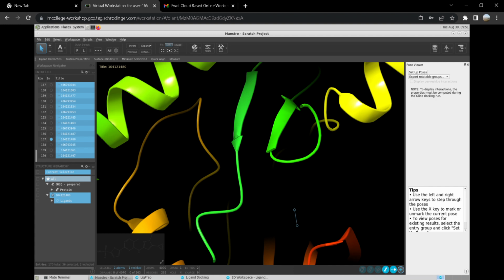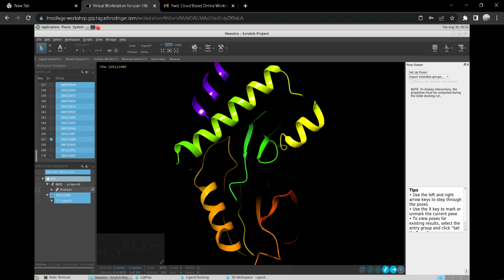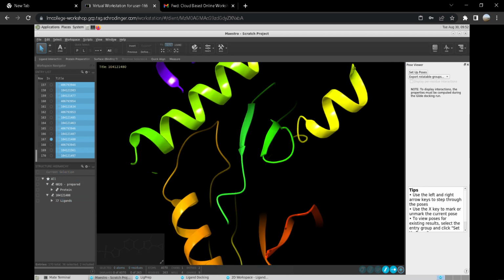So I've shared the docking analysis. Once that comes, then I will be able to show it. But in the meantime, others can try it out. Anybody else have any other questions? So in the project table, we can see the complete docking score and the other sub scorings.